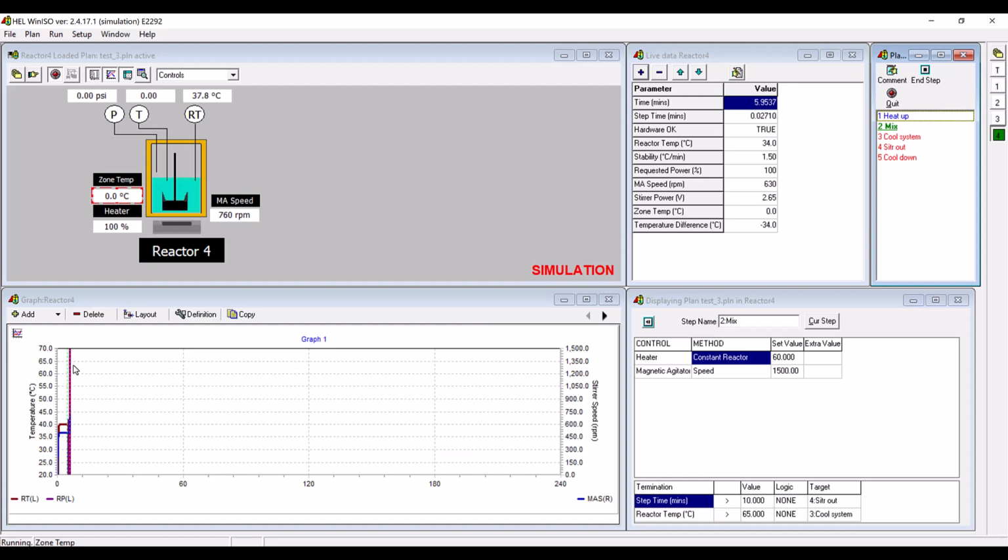And what we see is that we now have this red line here. This red line indicates that the step has finished and we are progressing to the next one. And we can appreciate here what I mentioned before: now that we have finished the step, it has become blue, and then we have green because it's the next one.